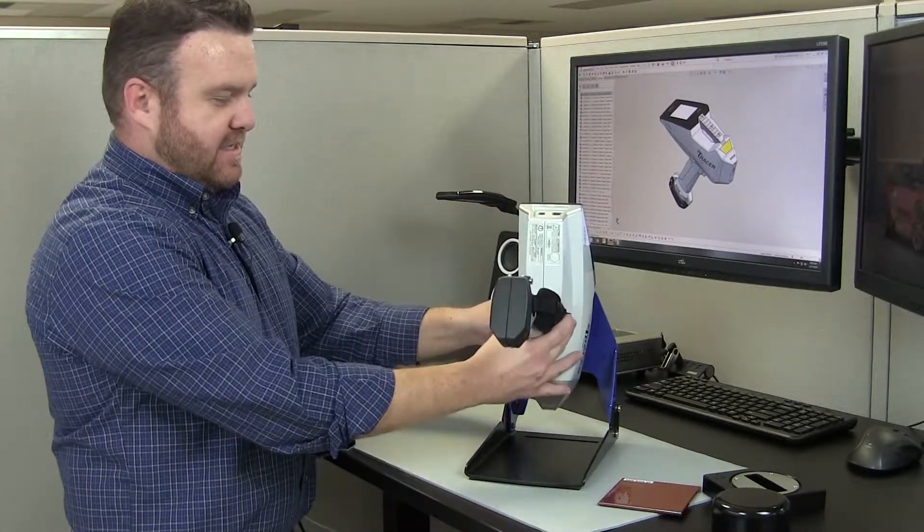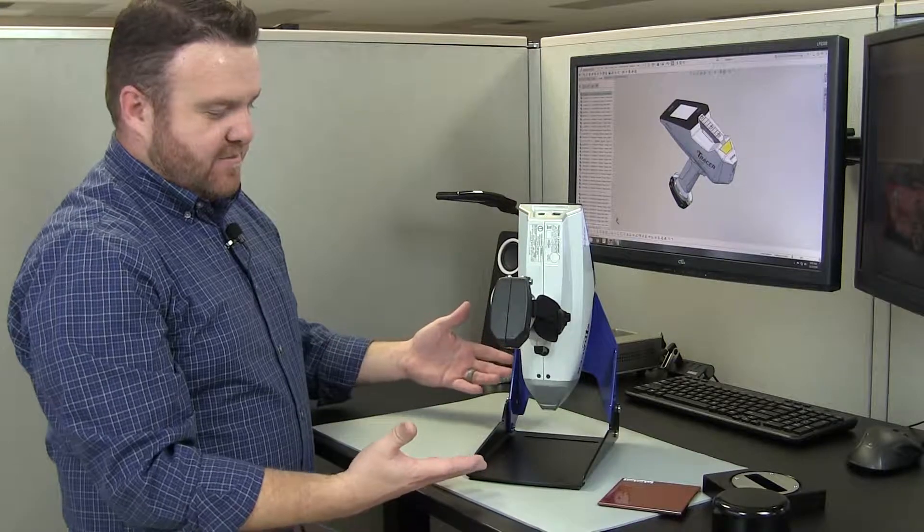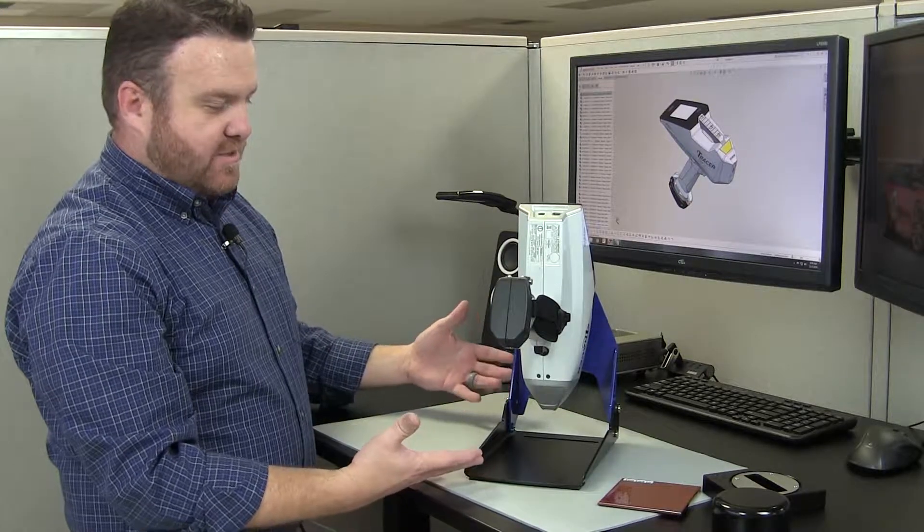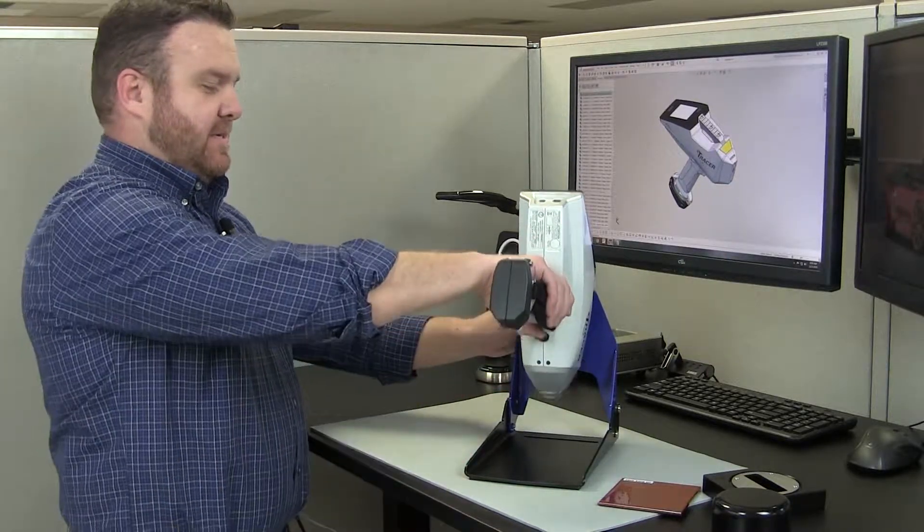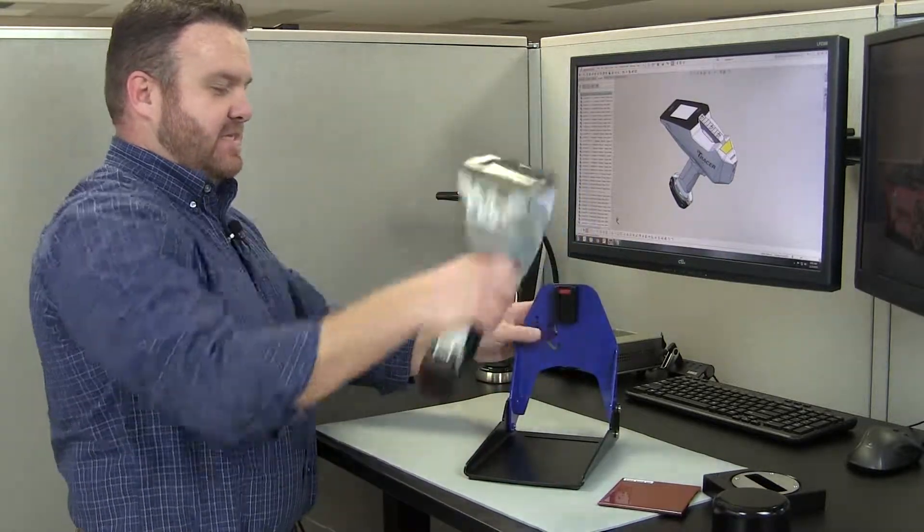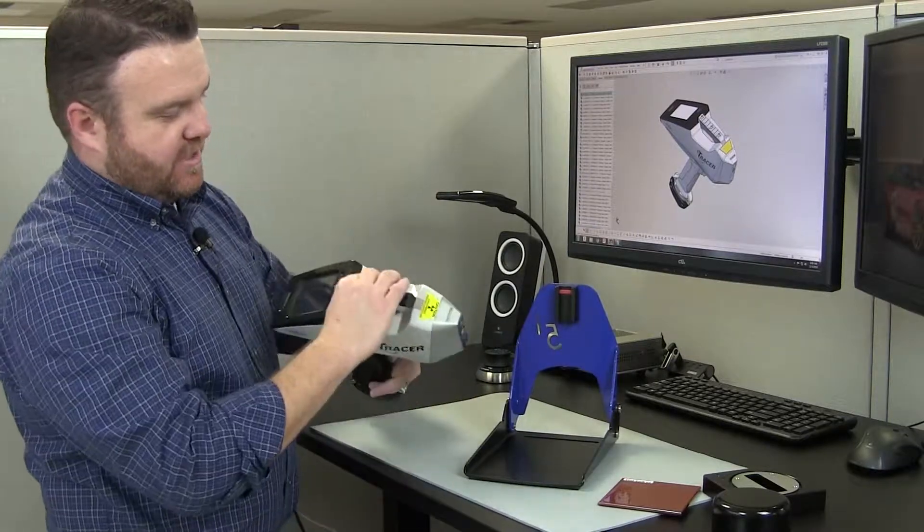But it comes out very compact so it's easy to travel with, easy to assemble with our rail system.